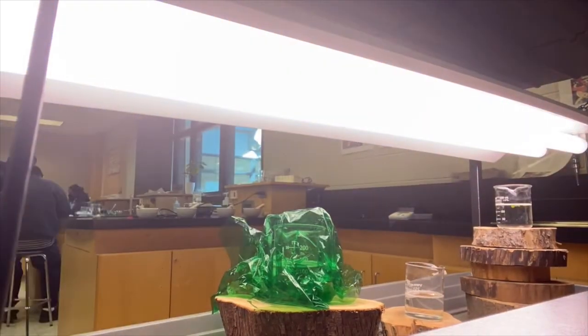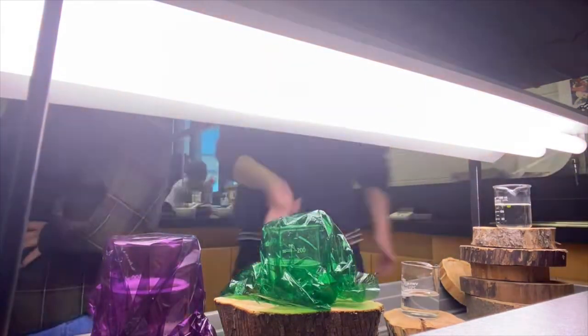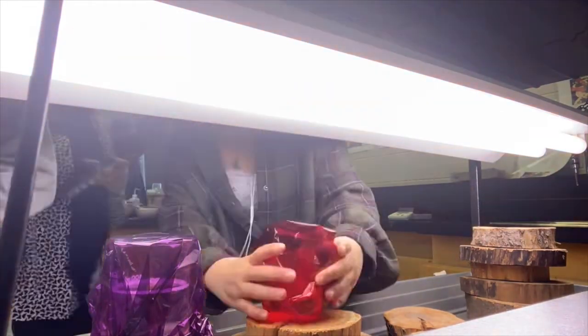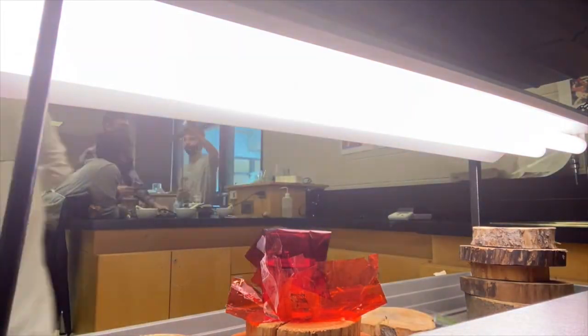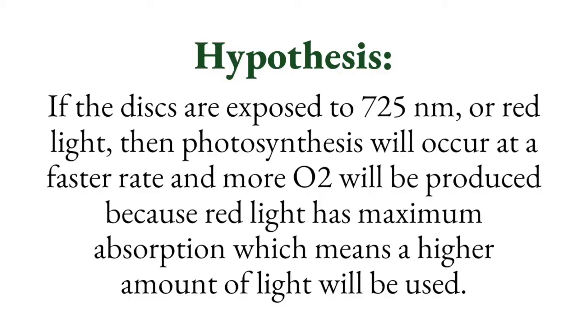In this experiment, though purple would provide the most energy because of its frequency, red light was hypothesized to make the most leaves float, as leaves are mainly composed of chlorophyll pigments. This was proven to be true, as 5 leaves floated for red, 1 leaf for purple, and finally none for green. The green light's results make sense, as green light would be the most reflected light for the green spinach leaves. To conclude, the hypothesis was proven to be correct, and red light is the best for a faster rate of photosynthesis, and consequently, oxygen gas.